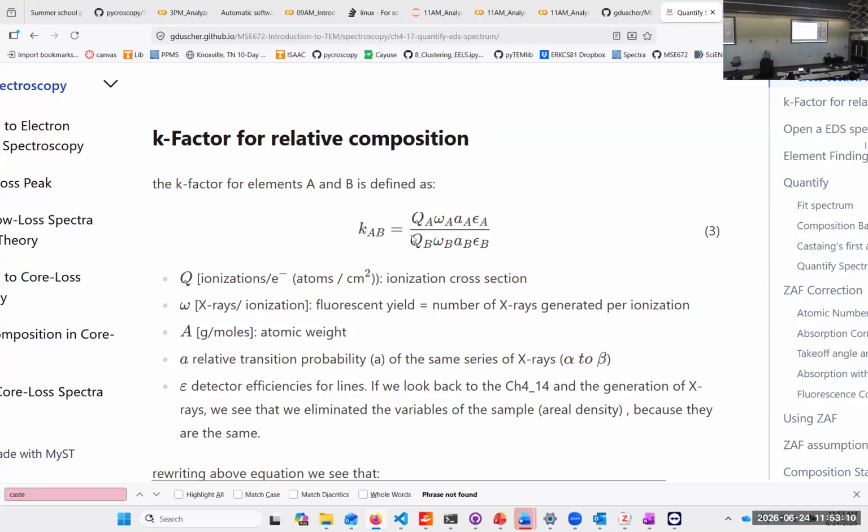So we use a reference here, and you see everything that's complicated and unknown is in here. So we just make, and you get this calibration specimens. You can buy them from NIST, and they have very, very well-controlled compositions.